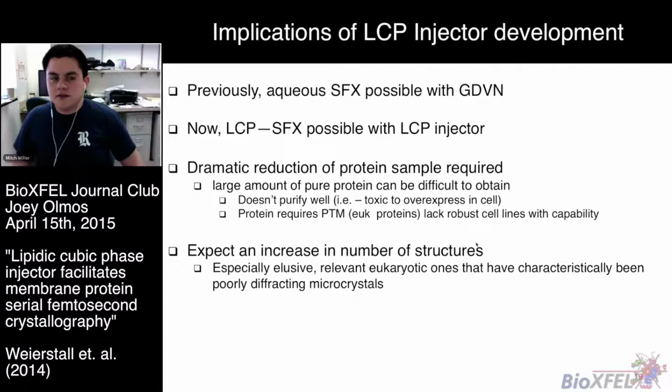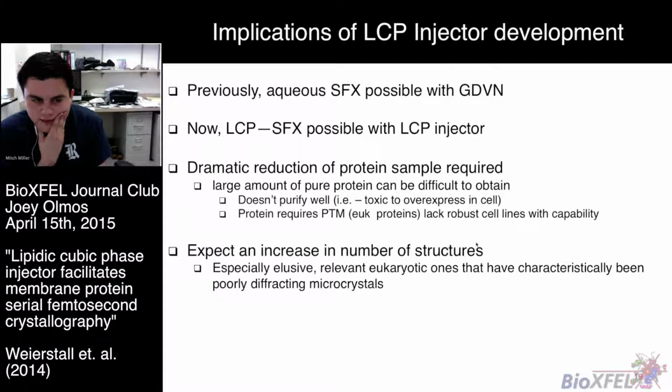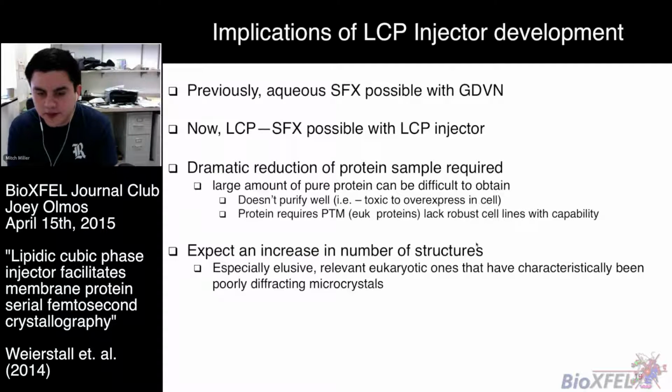And so the implications of this paper is that previously SFX was possible with aqueous soluble proteins delivered to the XFEL using this gas dynamic virtual nozzle. But now with this proof of principle study, they're able to do LCP SFX studies. And so you get this dramatic reduction of protein sample required. And sometimes it can be difficult to obtain large amounts of pure protein for crystallization, right, for various reasons.